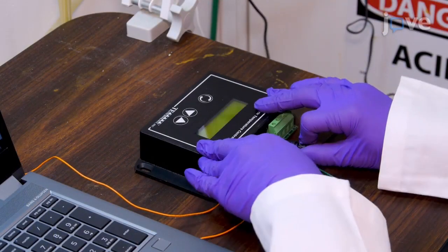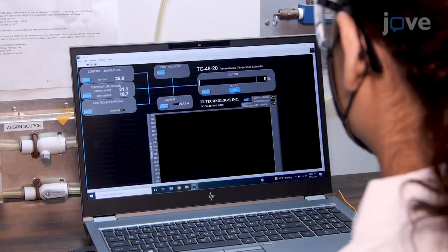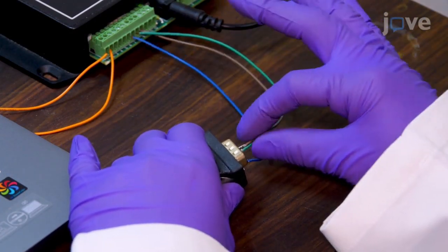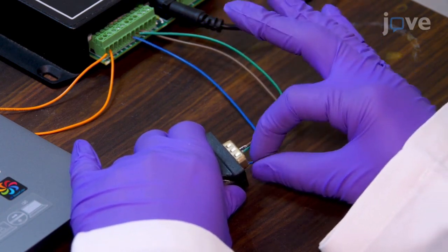Turn on the power for the thermostore and the thermostore software on the computer. Check the ribbon cables and make sure they are properly connected to the pins on the RS-232 cable pinouts.